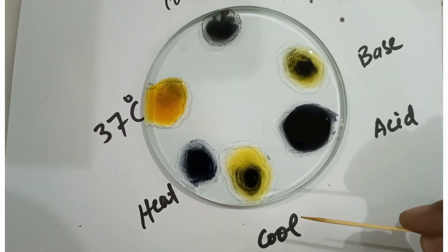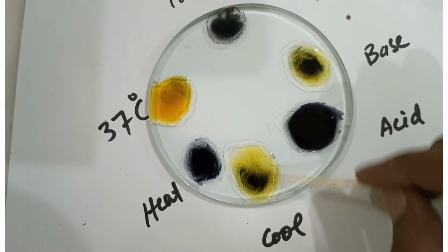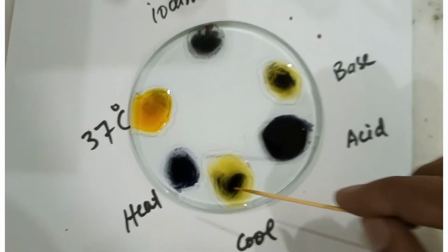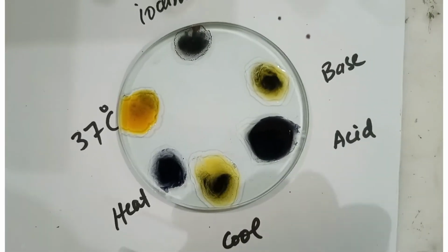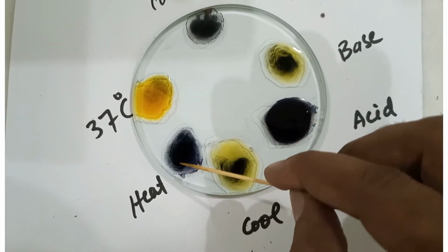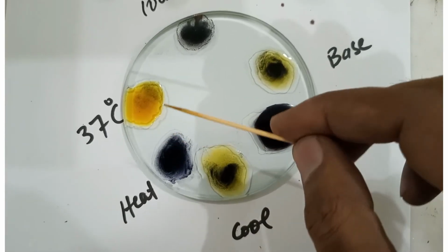The enzyme that was in the freezer also gave us a little activity but not optimal activity. So a bluish color is still present. It means some amount of starch is still present, so amylase could not work optimally. In the test tube that we heated, amylase could not work at all. The color of this solution is still blue. It means starch is still present in this solution.